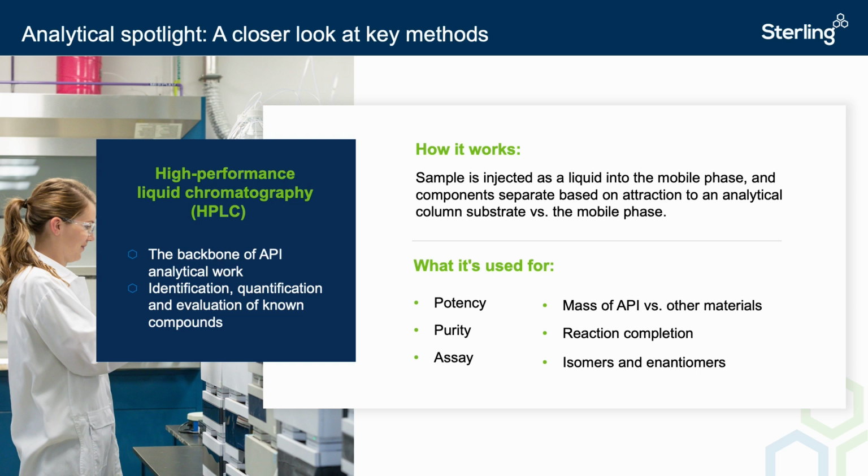Chromatography is also a good method for confirming the identity of a compound based on comparisons to the retention time or spectra of a standard.